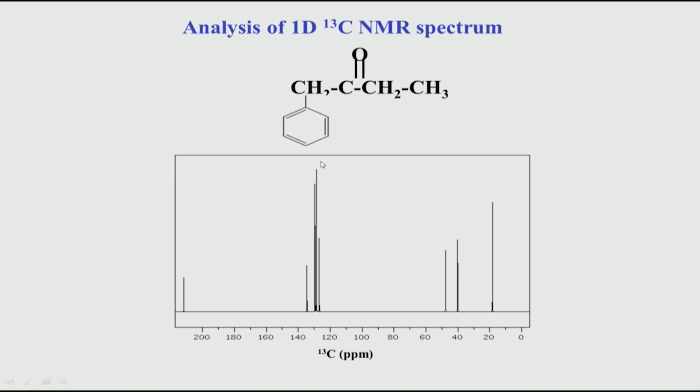Typically, when you are trying to simply assign this molecule to the spectrum, we do not look at the details of these peaks in the aromatic region, because like we saw in proton, you have a complication here called strong coupling, and there may be a lot of overlap and more signal intensity loss, etc. So, what typically is done is you just look at the region qualitatively, and if you see peaks in this region, you can be assured that there is an aromatic spin system. This is how you assign qualitatively.